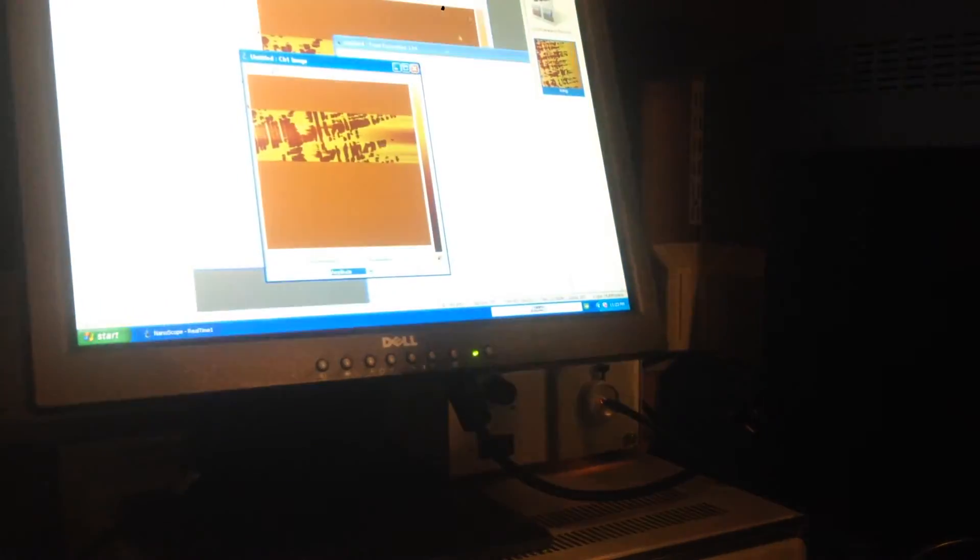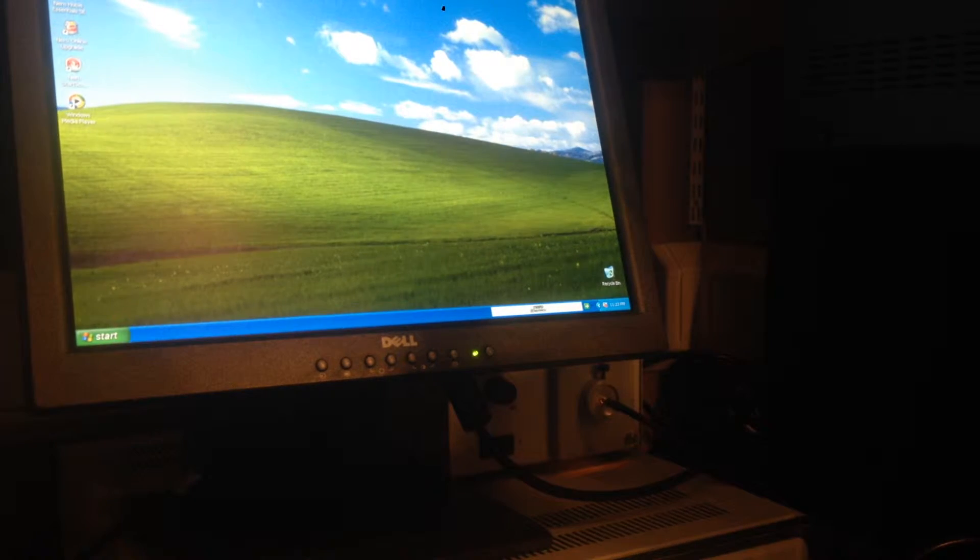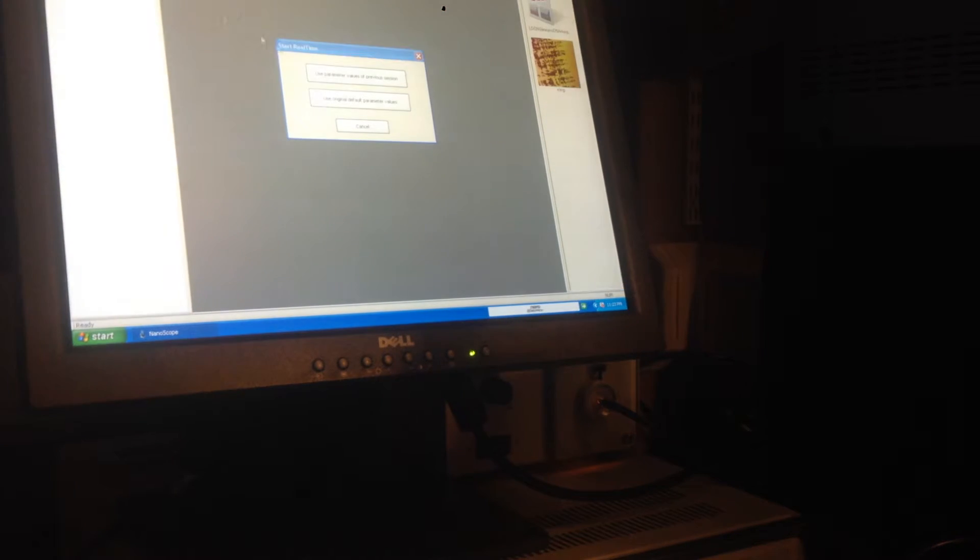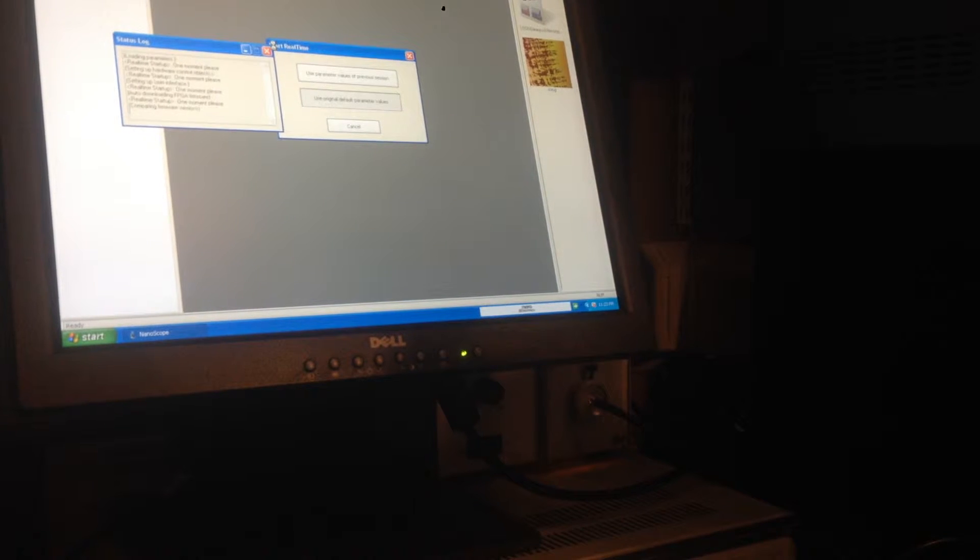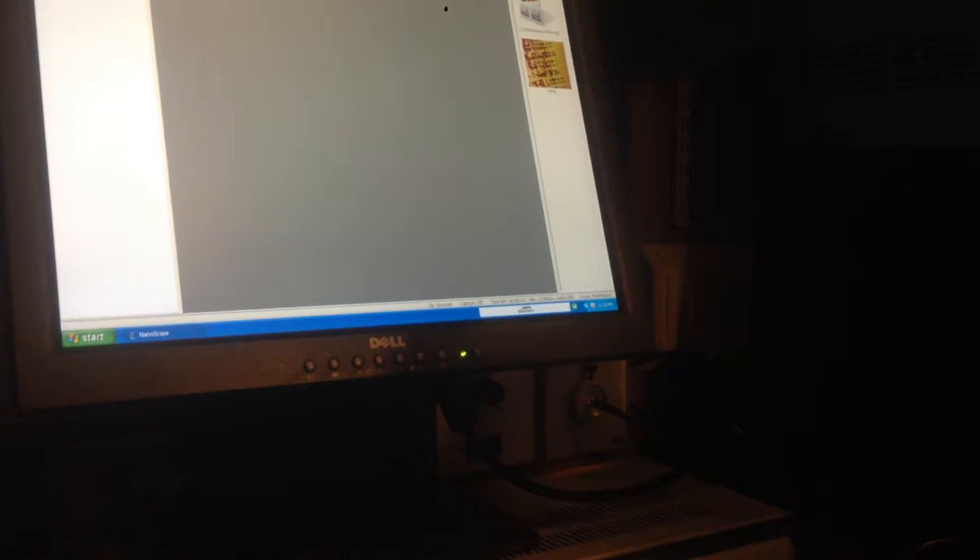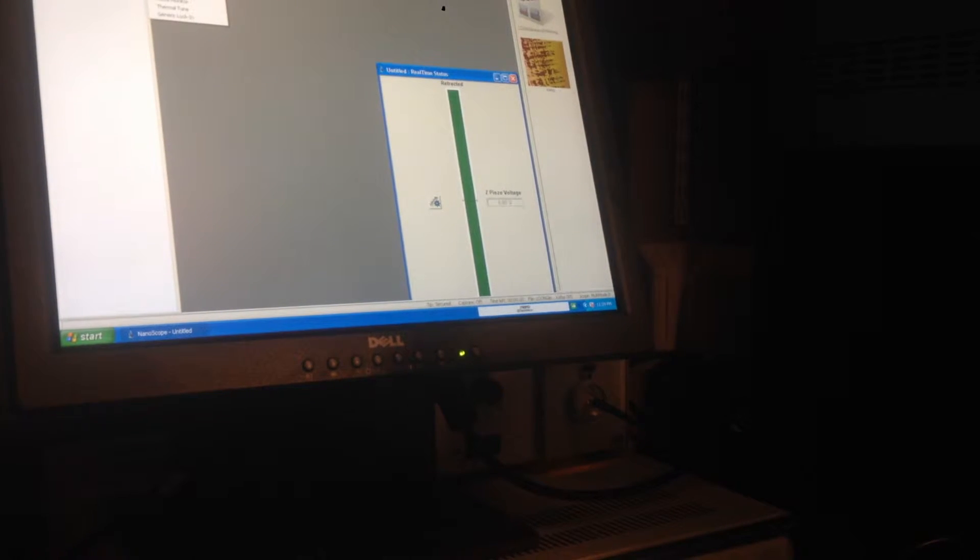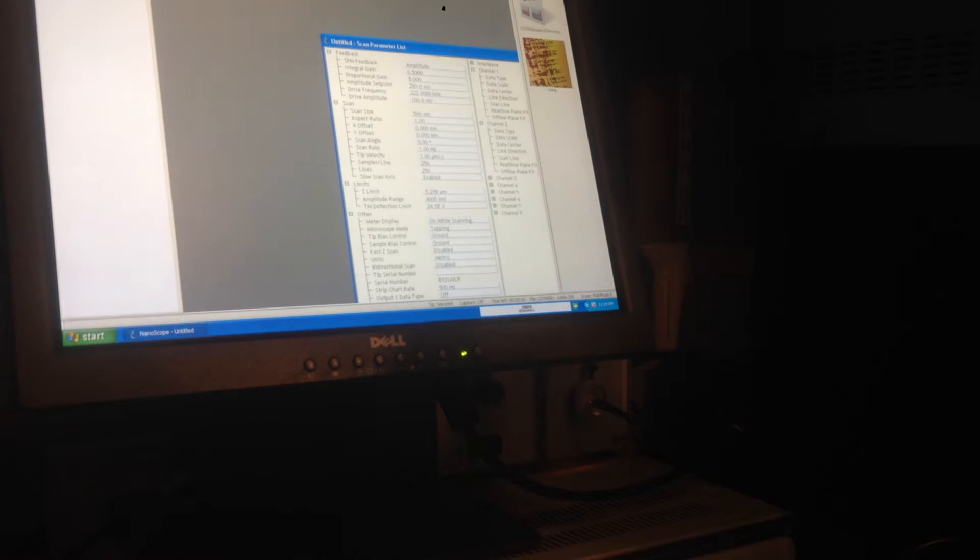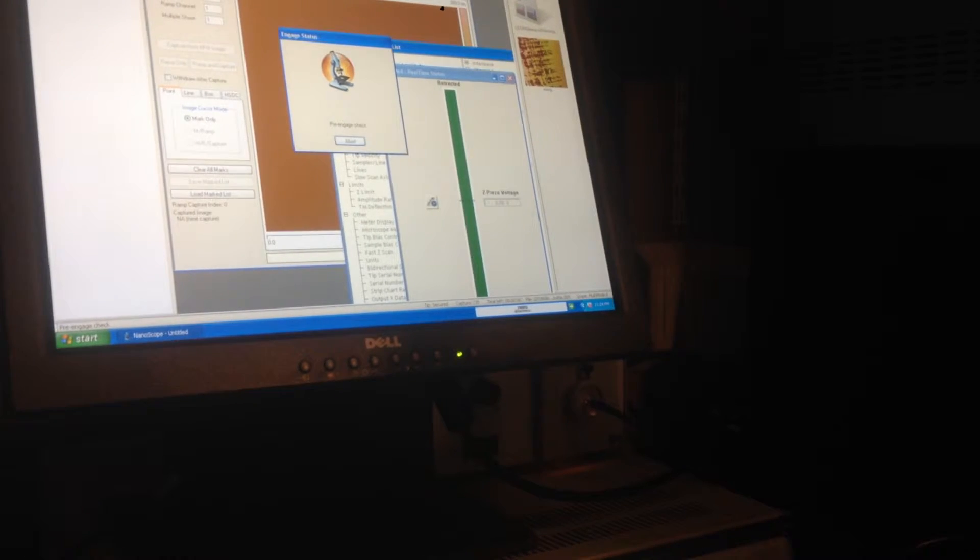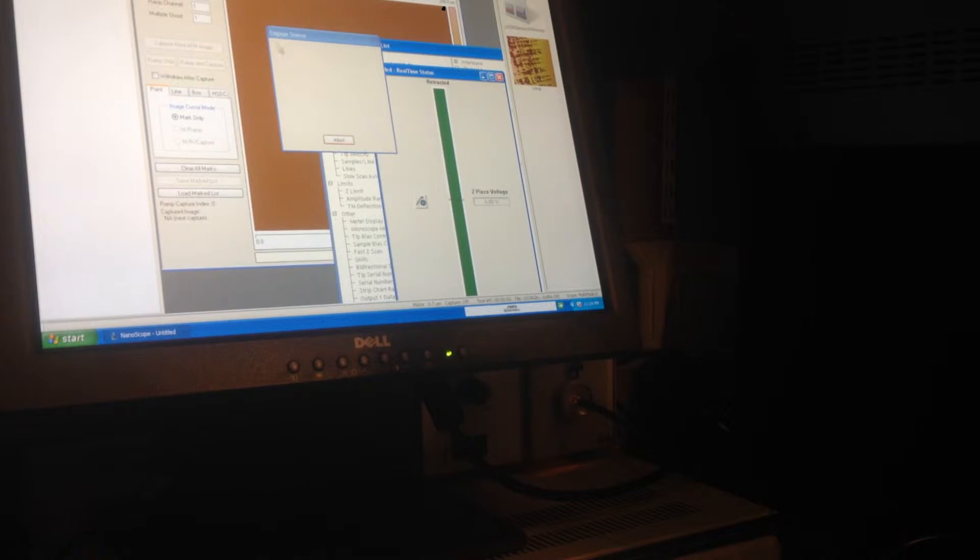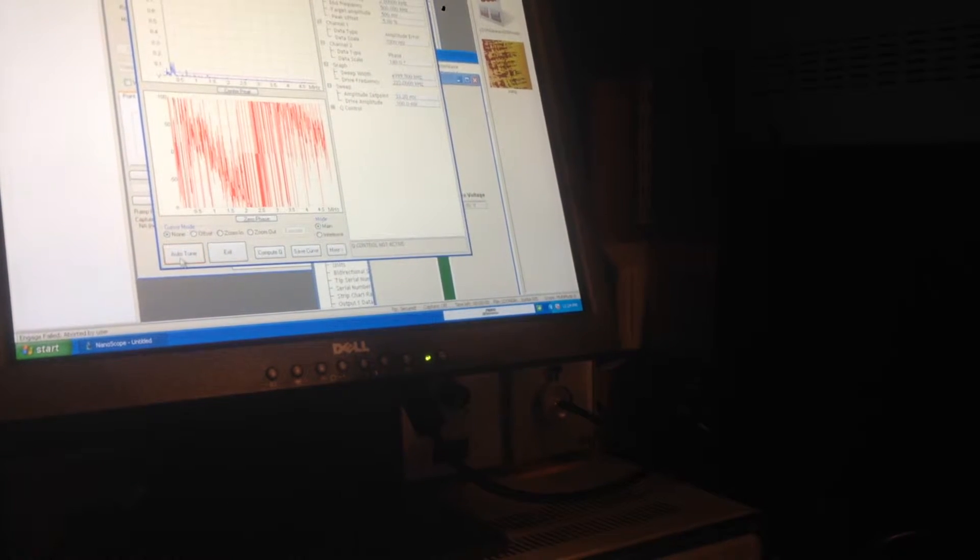Basically, you're going to start up the Nanoscope 8, use the defaults, then add real-time status, parameter list, and scope. You click engage - oh no, you don't want to do that actually. No, you don't want to do that yet. First you want to tune the cantilever, so you hit tune cantilever.